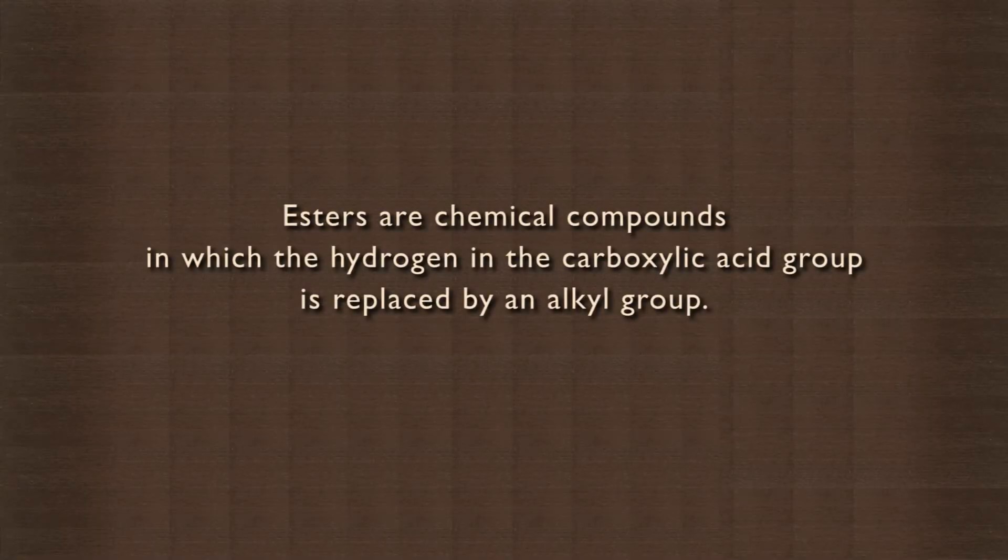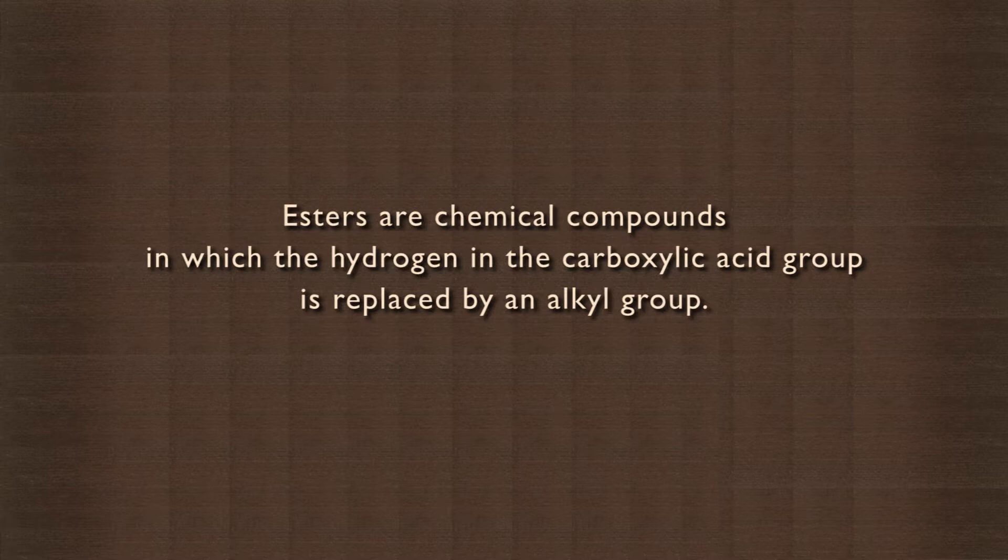Esters are chemical compounds in which the hydrogen in the carboxylic acid group is replaced by an alkyl group. Esters are prepared by reacting carboxylic acid with an alcohol in the presence of an acid catalyst. We will look at one such reaction today.